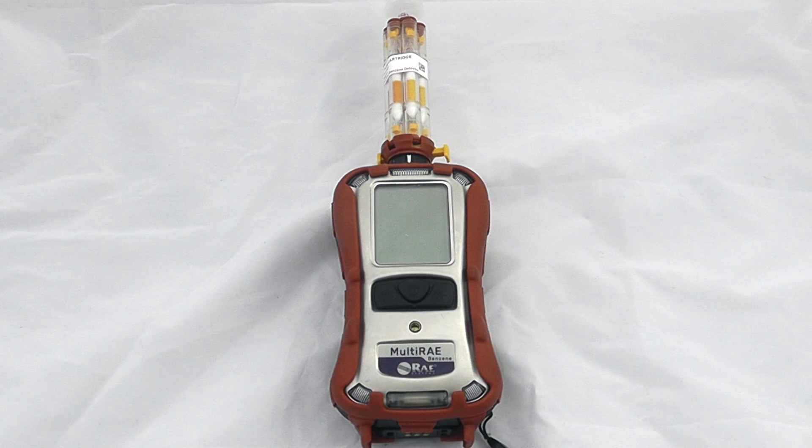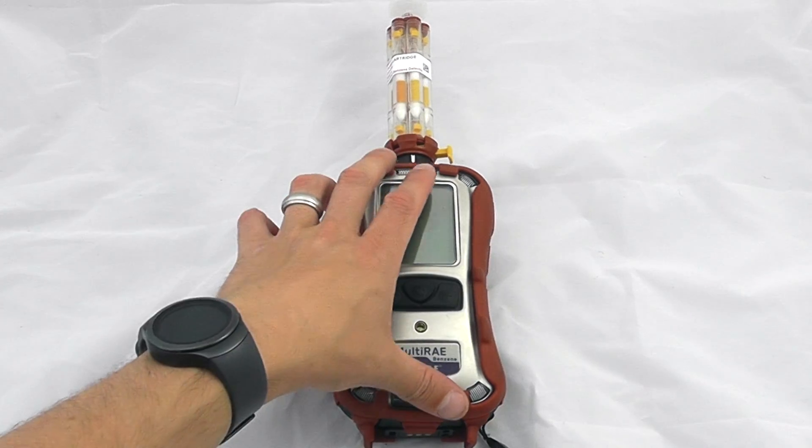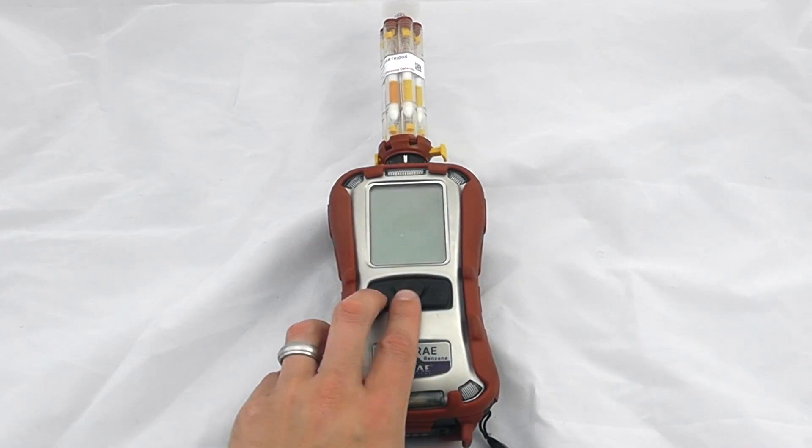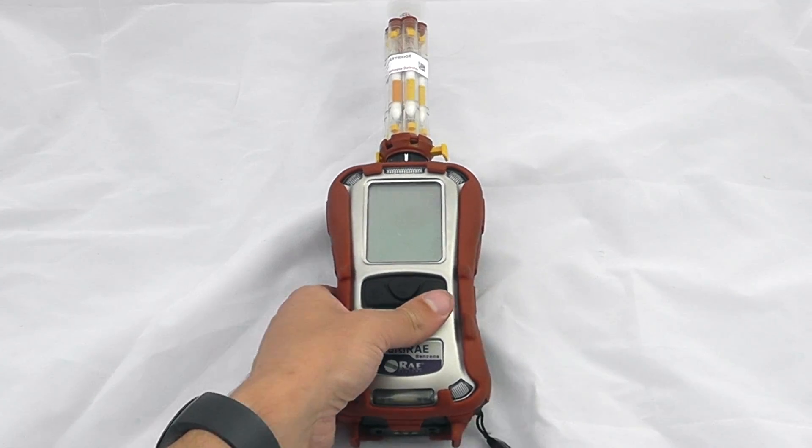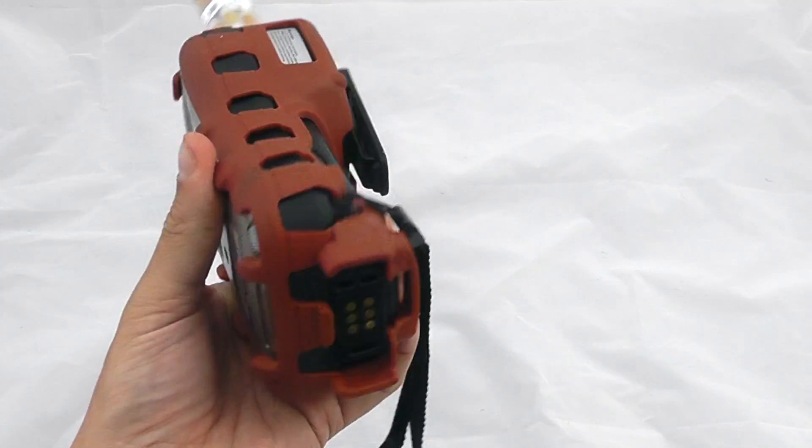Welcome to the introduction to the Multi-Ray Benzene from Ray Systems. The Multi-Ray Benzene gives multi-gas functionality along with benzene-specific measurement via the multi cartridge. Operationally, this works in exactly the same way as the regular Multi-Ray, which you'll be able to see in one of our other videos.